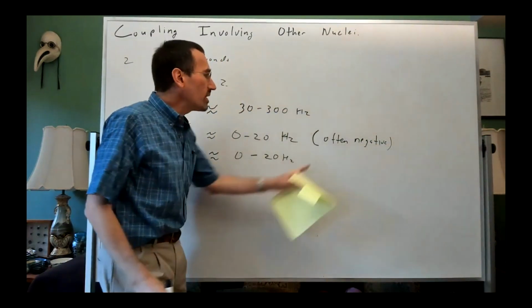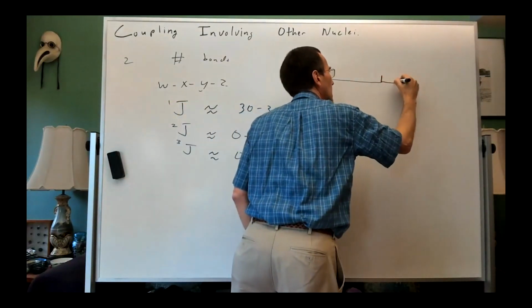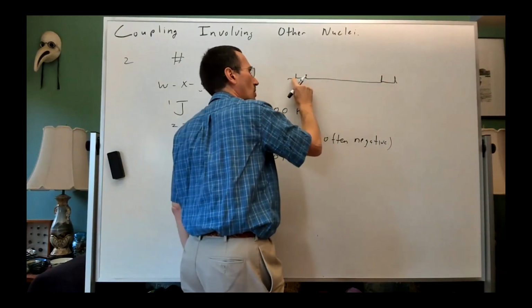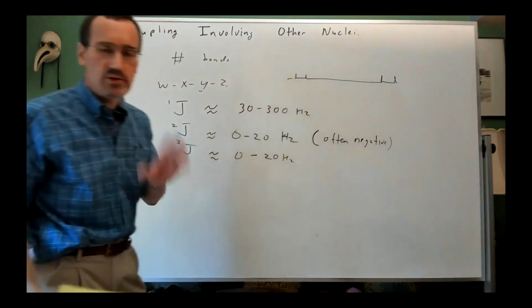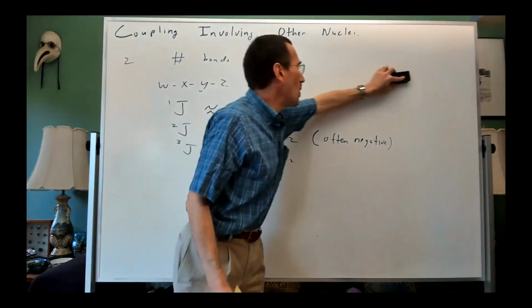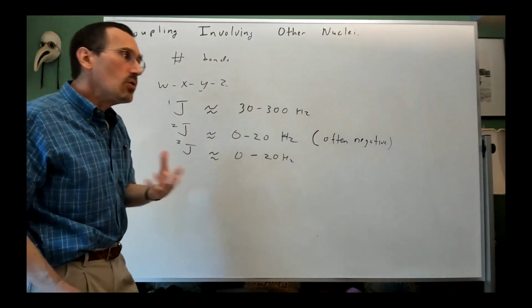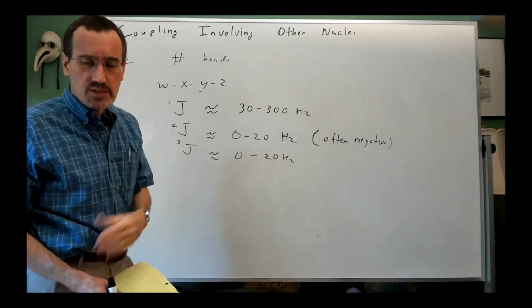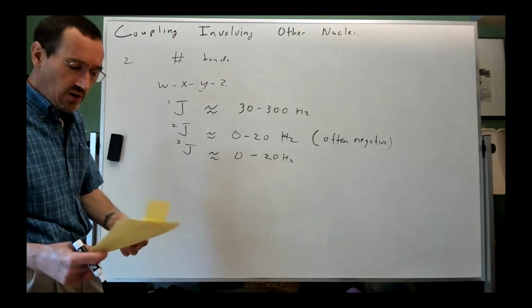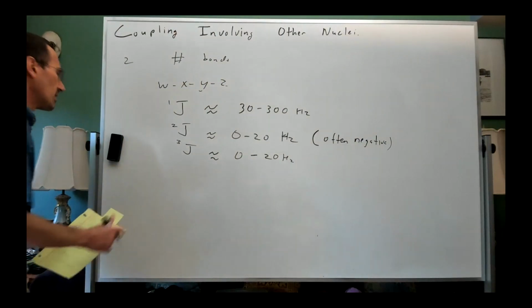And negative only has to do essentially with, if I have something like this, whether this line is associated with this line or whether it's associated with this. It has to do with the transitions. So as far as you're concerned, being negative won't affect you. The only place you might see some effect is in a certain type of COSY spectrum called a COSY 45 spectrum that can give different shaped cross peaks as a subtle indication of whether something is two bond or three bond coupling.